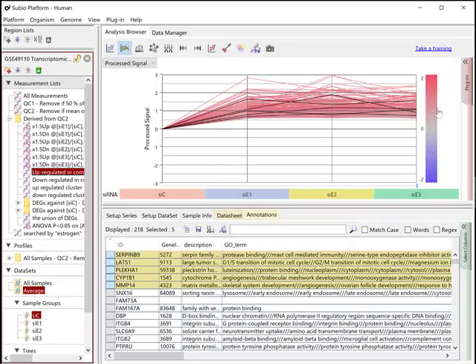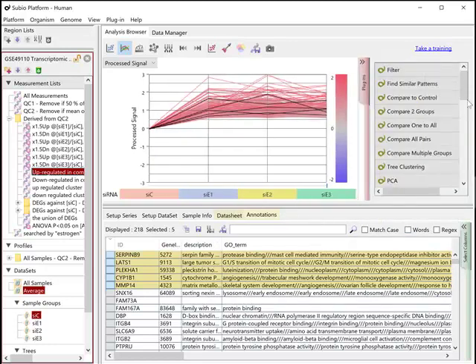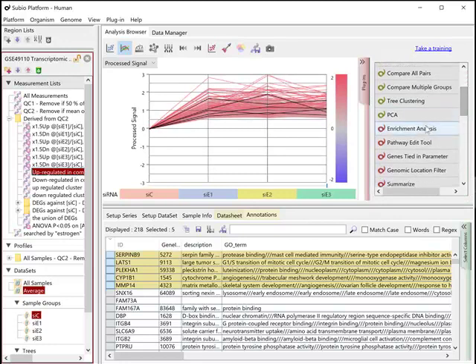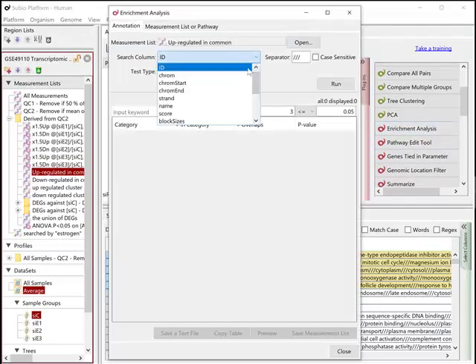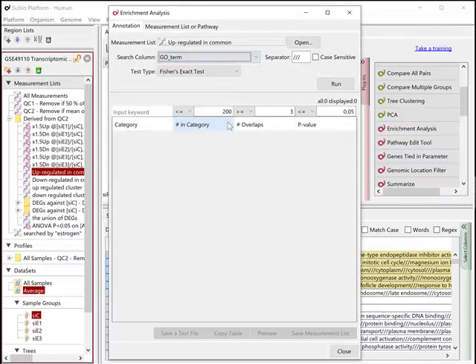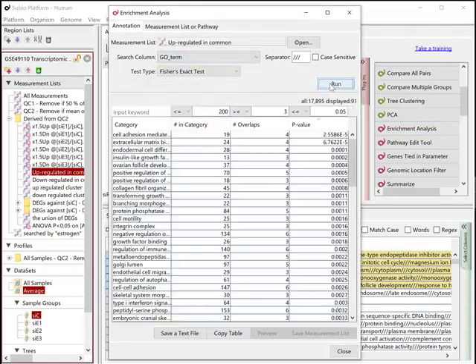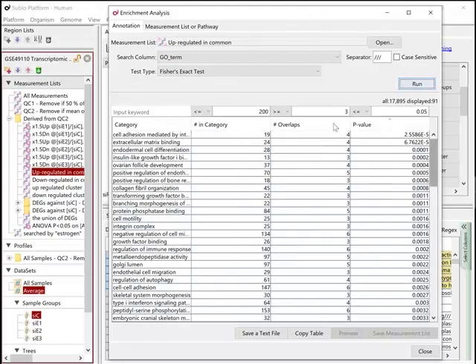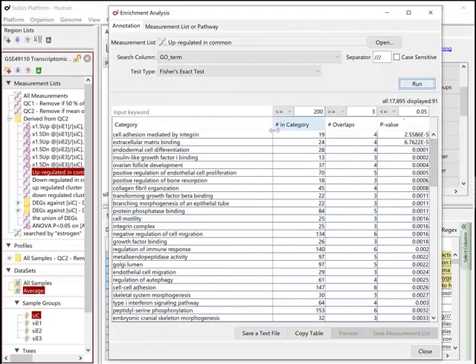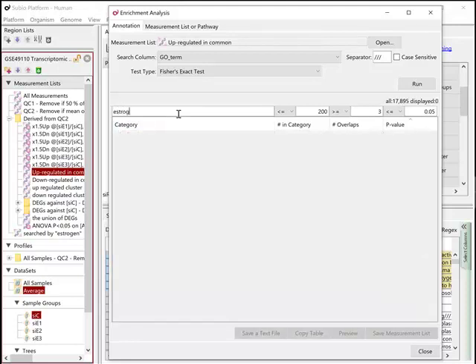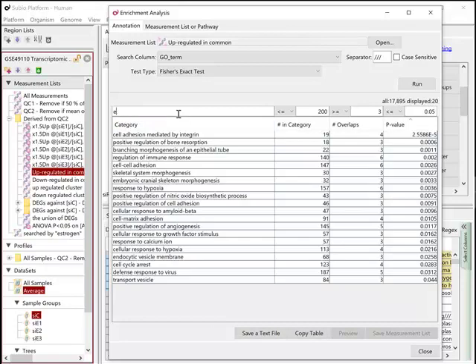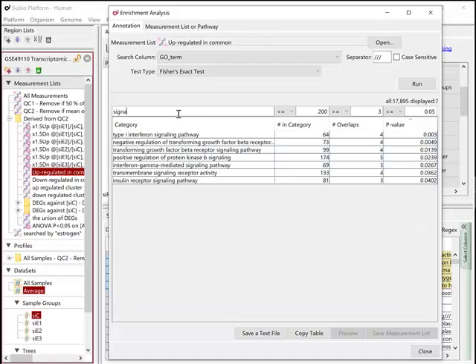Because the commonly up genes are remarkably more than down, the up genes are likely to associate with some biological functions or pathways. The Enrichment Analysis tool in the Advanced Plugins package is useful to search enriched biological features. Please learn more about the enrichment analysis in the dedicated tutorial. You can filter the result by keywords like estrogen or signaling, and you can trace what genes they are actually.